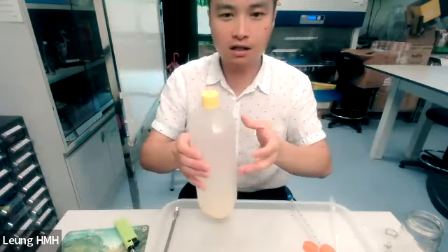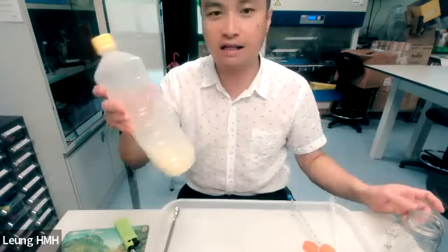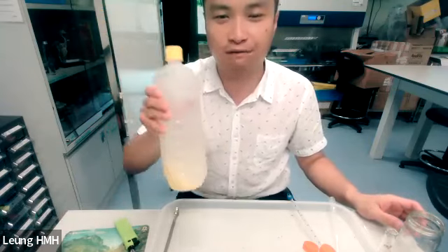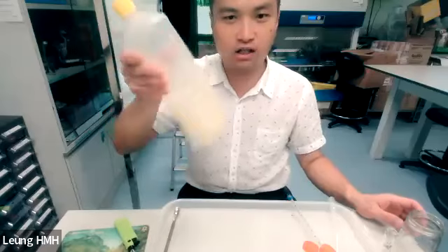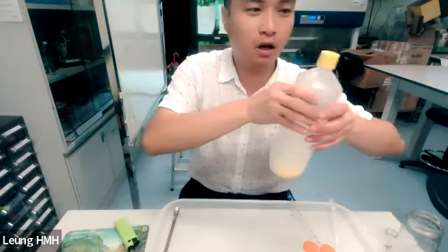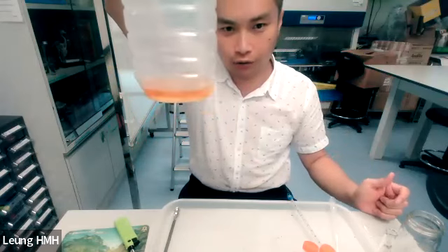And the time is going on, right? Because we need to shake for 50 minutes. It is impossible for me to shake it. You try to take a look at me, 50 minutes and you are just shaking. Oh, you may fall asleep, right? Okay, so as time goes on, I prepared the final product for all of you.